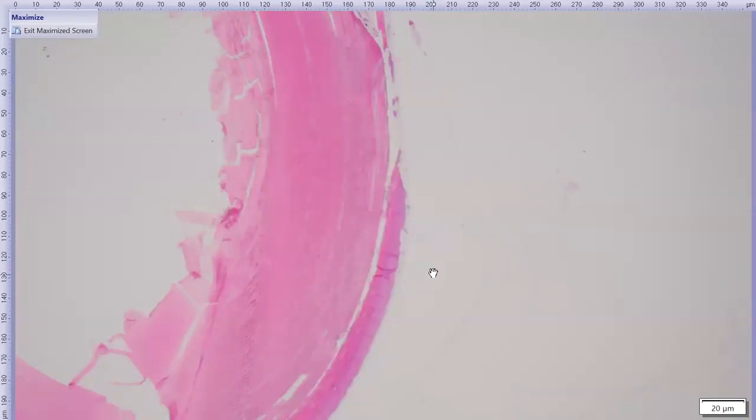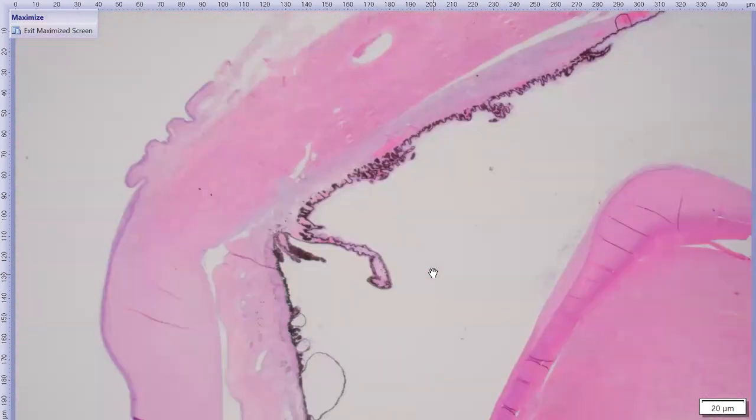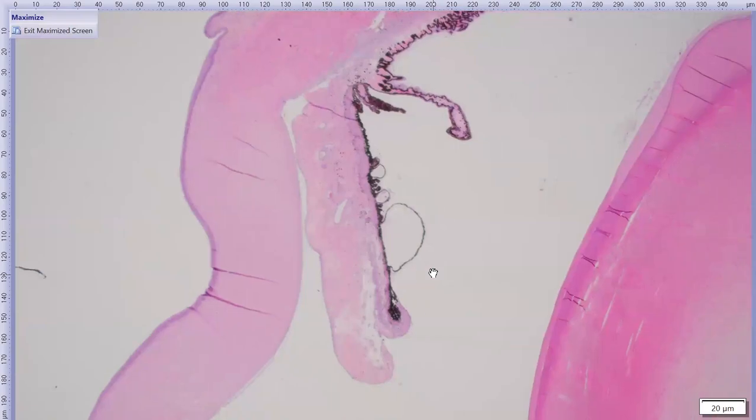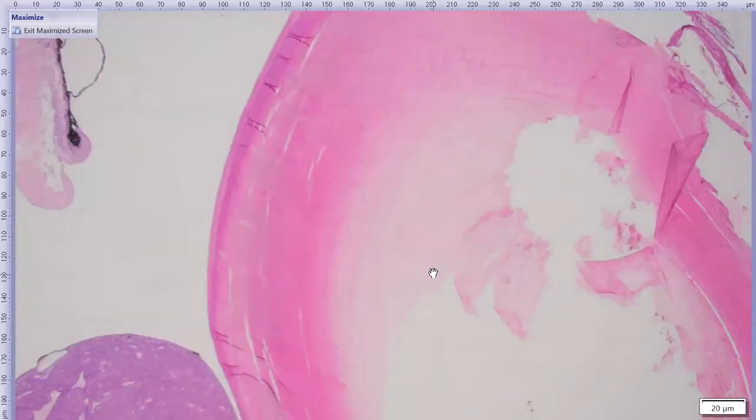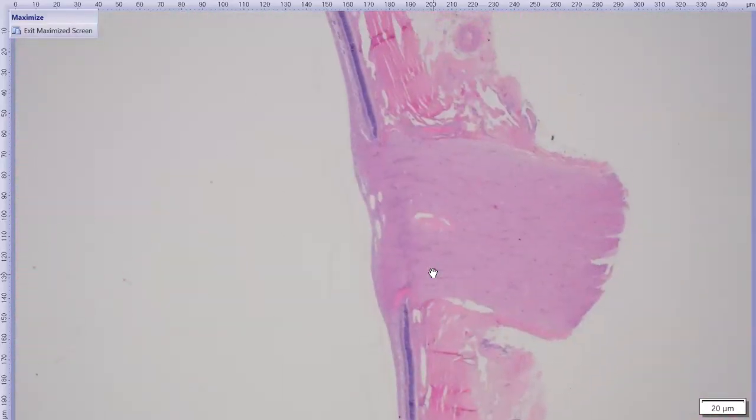And again, kind of hugs the lens here, it's attached. And there's a little bit of asteroid hyalosis kind of at the back here. This is a common feature with this tumor. We see it often enough that sometimes we get sad when we don't see it with this tumor because it's so commonly there. It's not specific for this tumor, but it's a very nice addition to it. And there wasn't much else going on in the rest of the eye, maybe a little preiridal fibrovascular membrane on the front of the iris. But the back of the eye was fairly quiet, so no evidence of glaucoma.